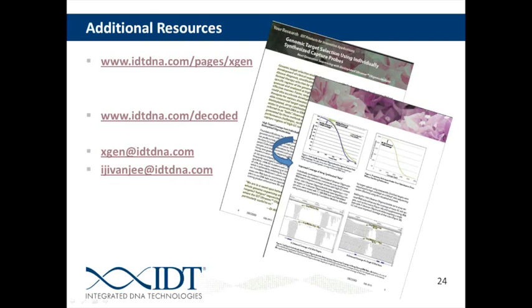So the next question here, well, I'll ask this question, so it's up to Adam. Have we done any sequence capture underlying QTL in plants? And what is necessary for successful QTL sequence capture? QTL, is that familiar? I believe they're referring to quantitative trait locus. Oh, right. There you go.